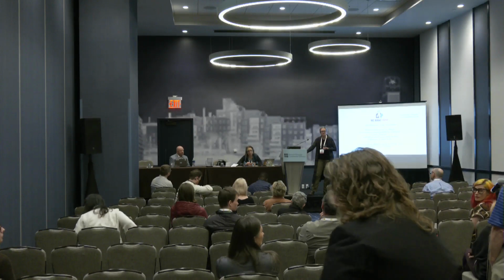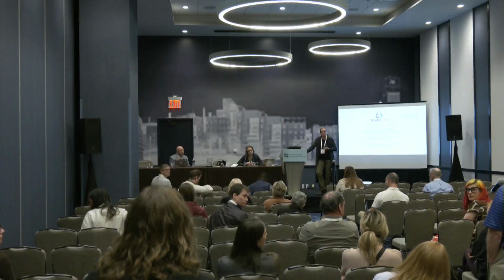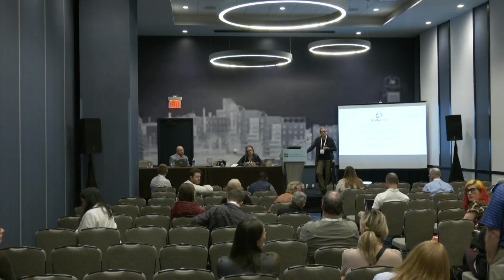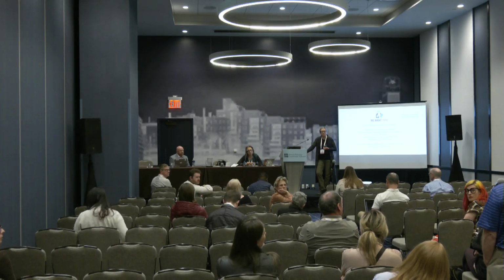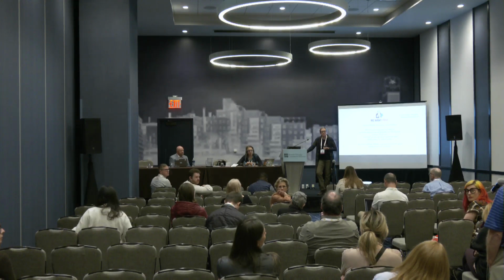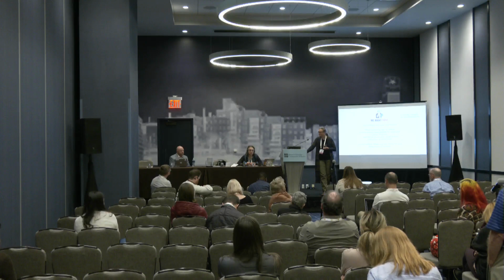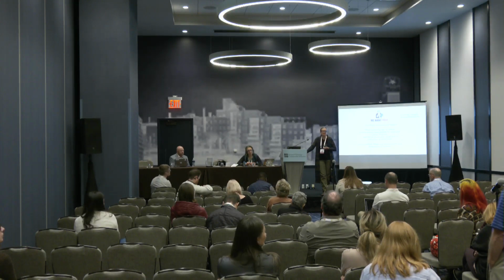I don't know if there's anyone here from the local Minneapolis imaging community, but at our microscopy conference last year, Mark Sanders introduced, I think it was a Python script that would write your materials and methods from the metadata. Yeah, that's Methods J2. Great idea, I thought.